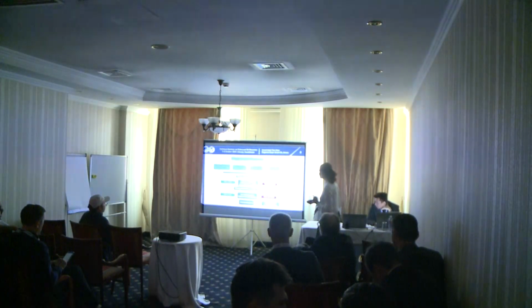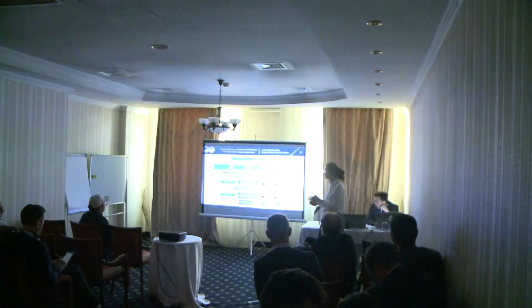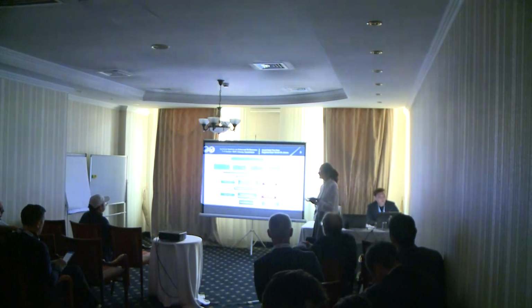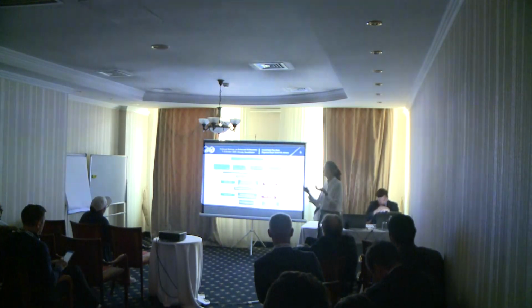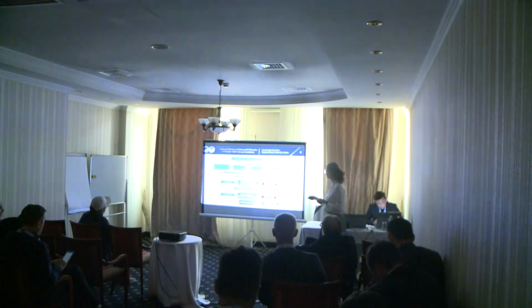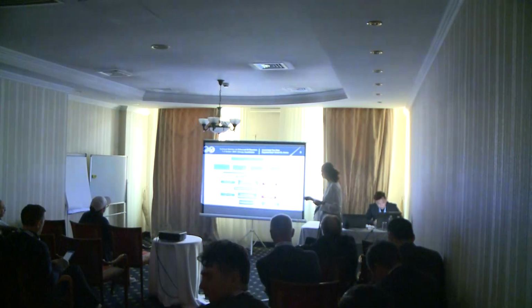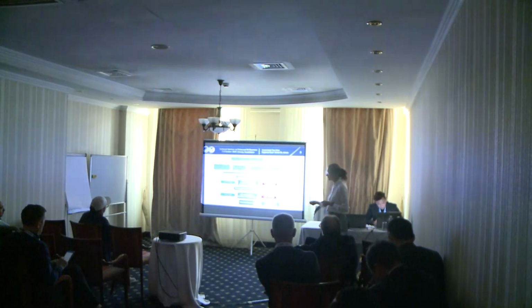Thank you. So then we do rheological studies, which I mentioned already. We build different curves, different dependencies on the polymer concentration, and on how the polymer viscosifying power depends on the temperature, and so on and so forth. Once we do those, the next one is resistance to degradation.